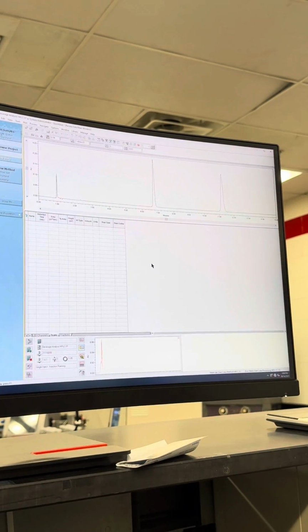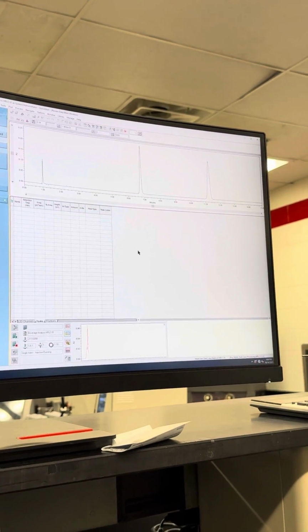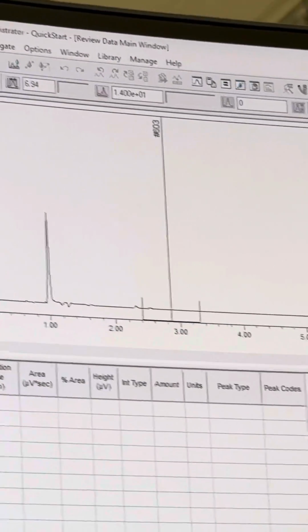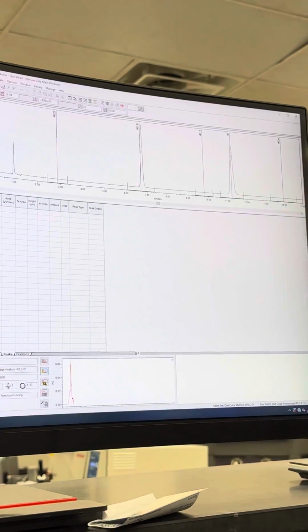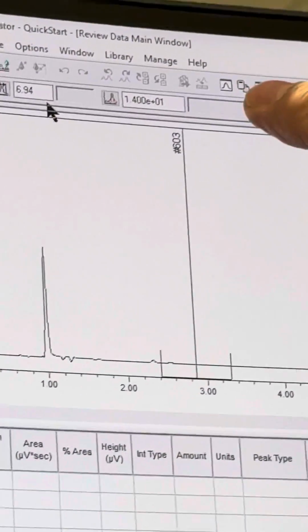But we're going to use a processing method, Diet Coke, which is down here. And we're going to see who is home. In this case, we don't have 603, 811, or 604. So we're going to remove these from the processing method. So we'll come over to this icon here, which is processing method.